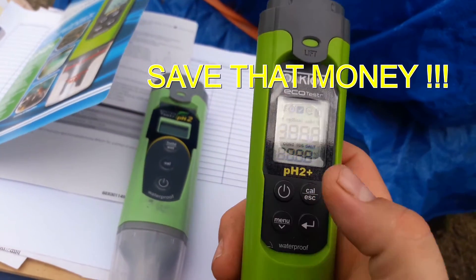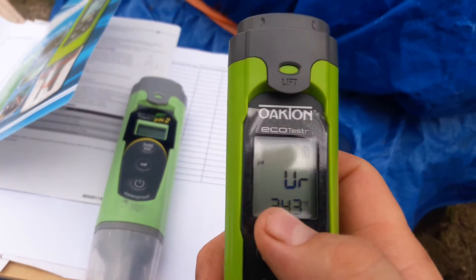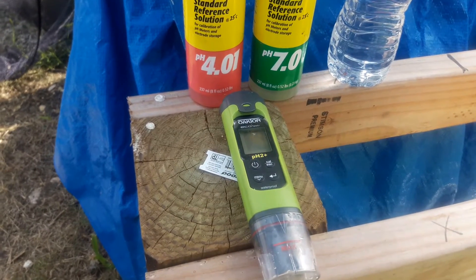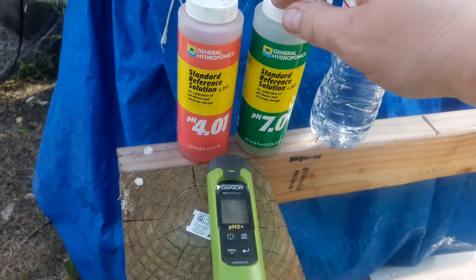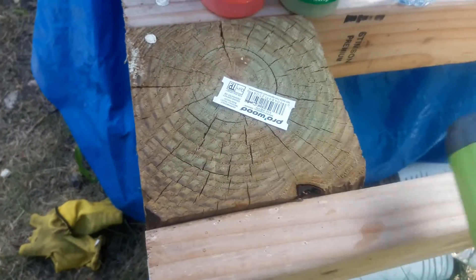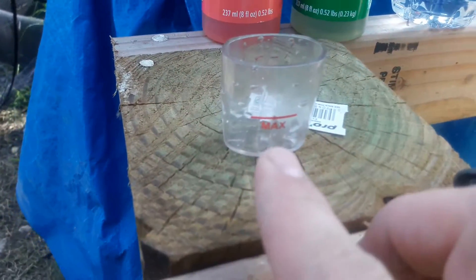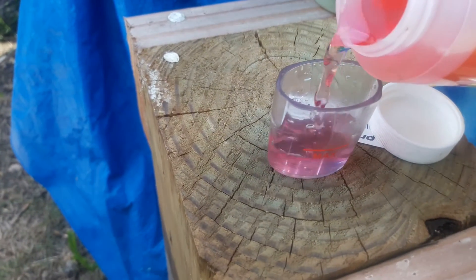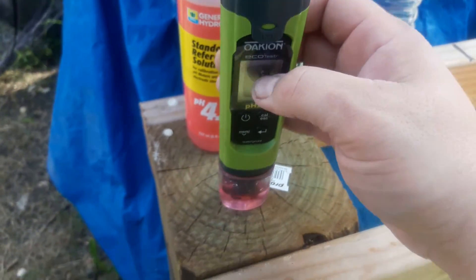When you turn it on, it shows your pH reading — right now it's showing an error code because there's no liquid in it. As mentioned, the Oakton EcoTester pH 2 Plus has three-point calibration at 4, 7, and 10. We're going to calibrate at two points today. First, take off the cap and fill to the max fill line. We'll start with the pH 4 solution — fill it up, turn on the pH tester, and stick it in the solution.